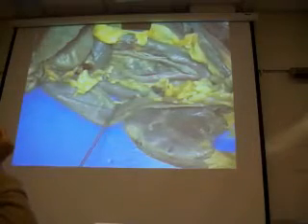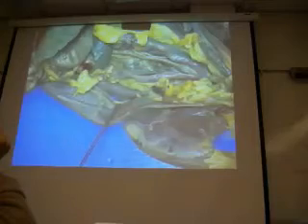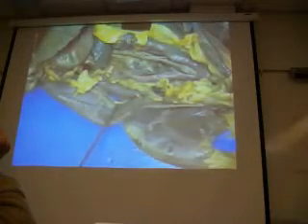All right, so that's pretty much everything for this guy. And then we can go over the male rat next time. And then I'll give you some time to look over some things, take some photos.